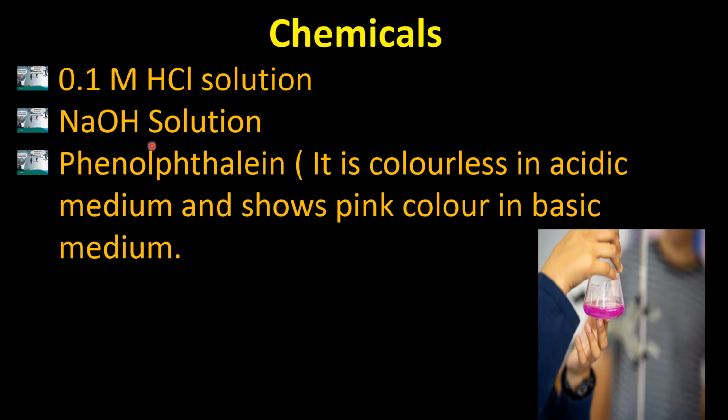The second thing is sodium hydroxide solution. It's a base, so it's an acid-base titration. But at this time, I don't know the molarity of the sodium hydroxide solution. I have to find it out. How? By the process of titration. So basically, this is volumetric analysis in which the molarity of one solution is known and the molarity of the other solution has to be found out.